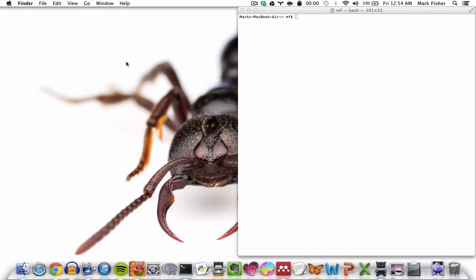Welcome back. In this module, we're going to talk about how to install HeFPipe. HeFPipe was designed to work on Mac OS X operating systems, and with all of the example files, requires about 32.1 megabytes of free hard disk space. HeFPipe is run through a command line terminal and requires basic knowledge of command line syntax. There are many basic tutorials available online. I provide a link to one of them in the user's manual.